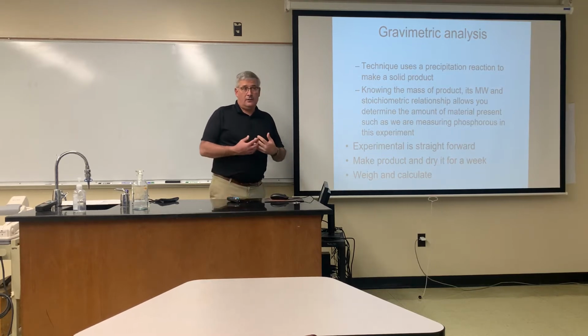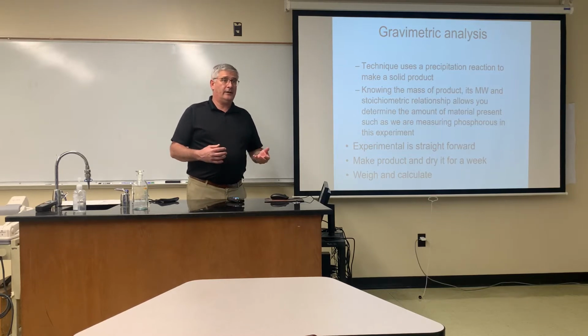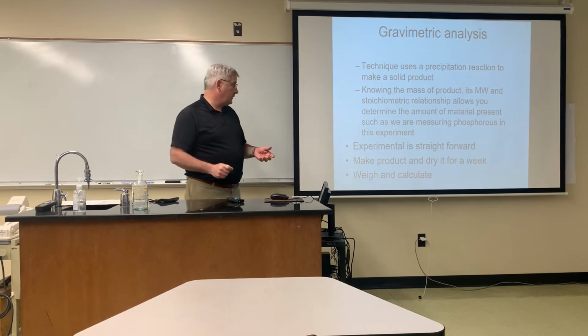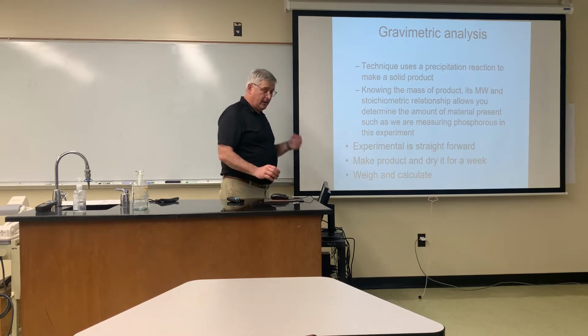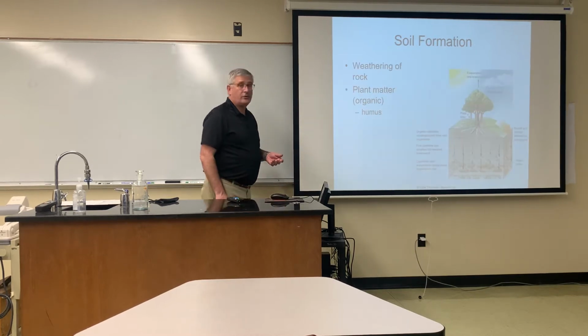Now, it always involves some math because the compound that we're precipitating is a magnesium ammonium phosphate with 6 waters in its crystalline form. And so we'll have to do stoichiometric calculations to get to specifically the phosphorus that's present. The experimental for this lab is very straightforward, and it will actually take a week, so it will be due in 2 weeks. It takes a week to dry the solid.